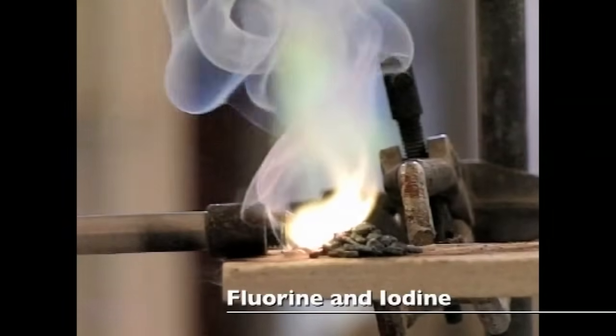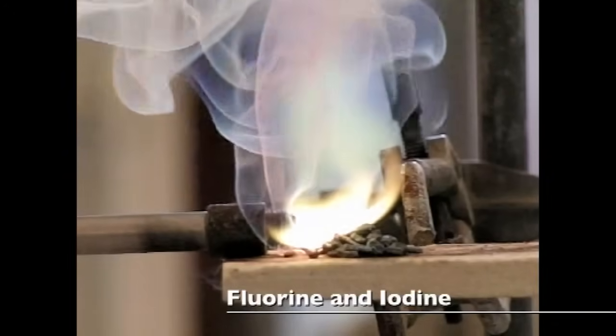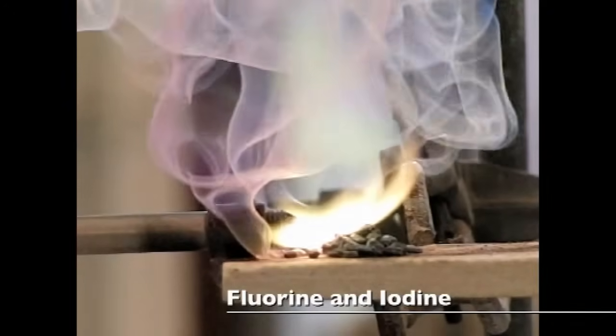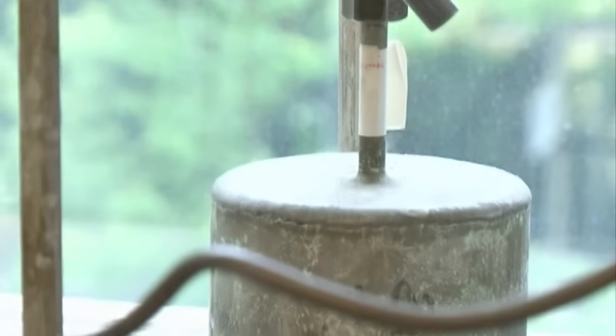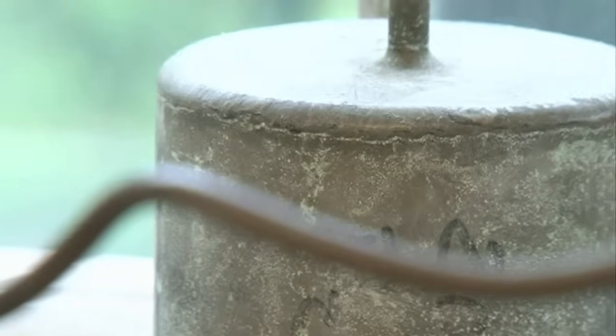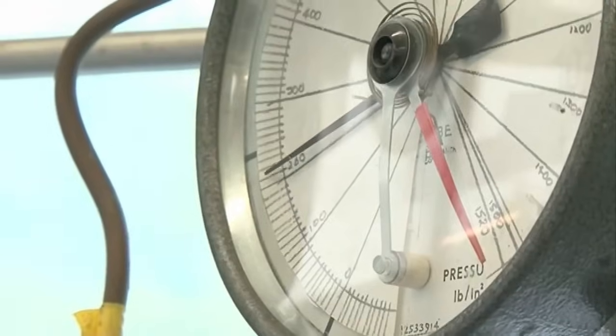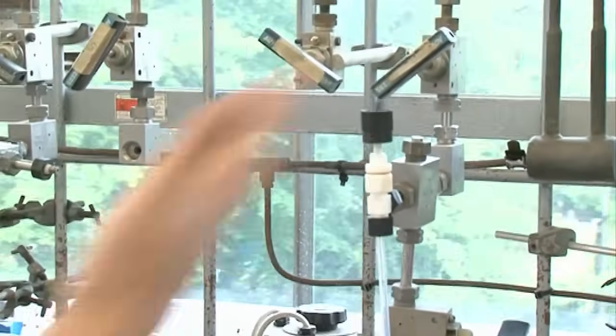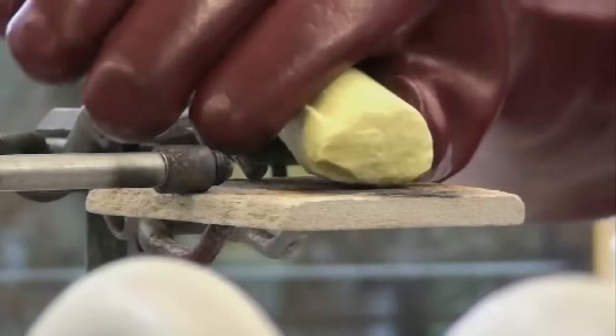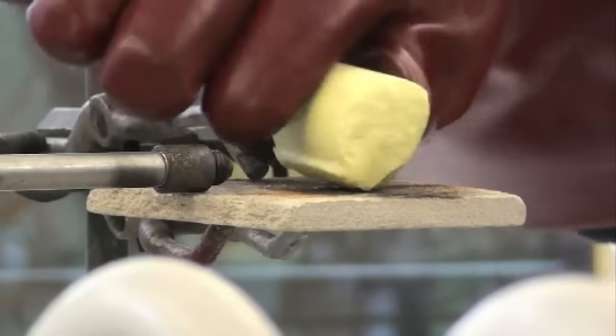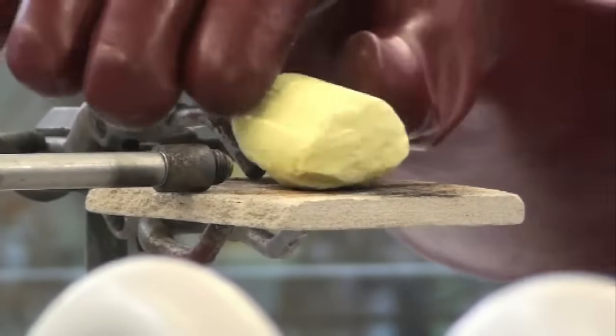And the hydrogen fluoride just eats through the glass. So you need to use equipment made out of metal, usually nickel. And the fluorine reacts with the surface of the nickel the first time you use it. And then you get a layer on the surface that protects the rest of the metal. So this is again fluorine with sulphur. So you can oxidise the sulphur probably to sulphur tetrafluoride or sulphur hexafluoride.